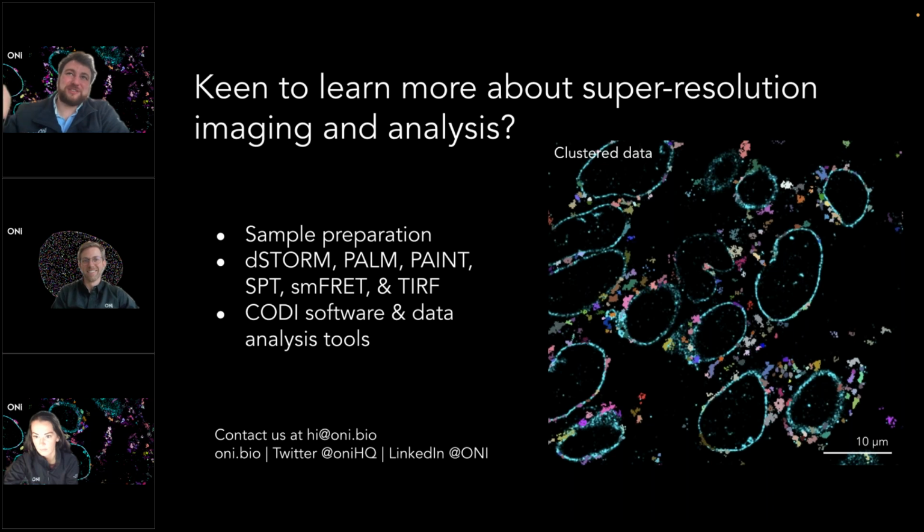If you do see some rainbows, then you can go to the advanced part of the tool and start playing around with some of the parameters. I would suspect if the default parameters haven't found any drift, then that's probably accurate and you don't have drift.